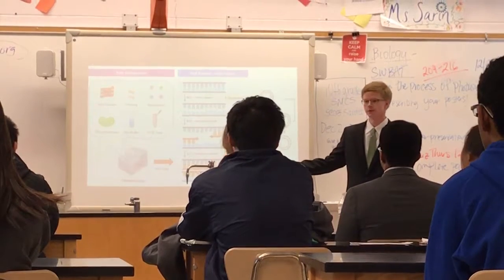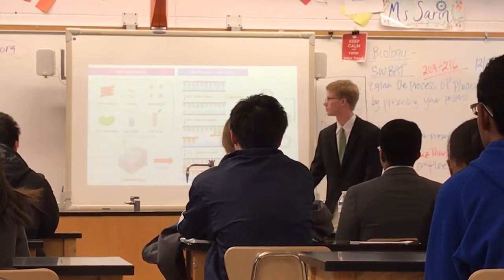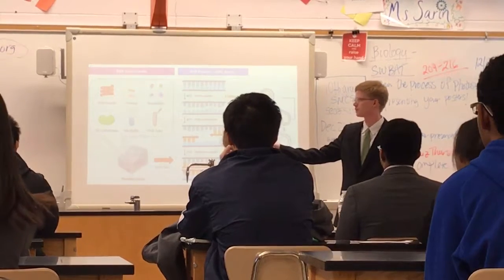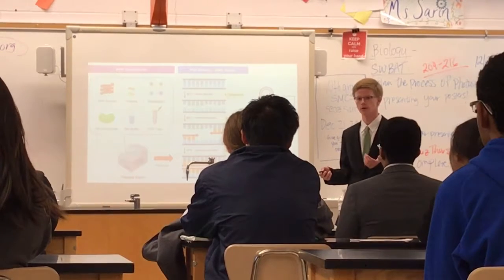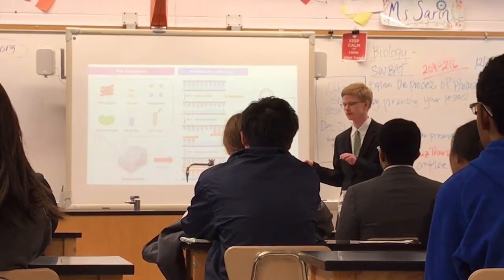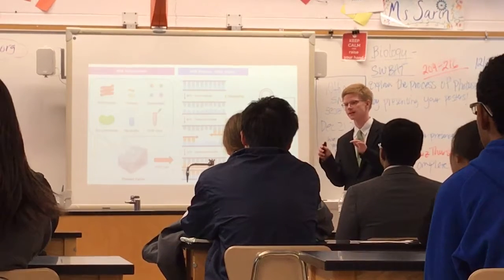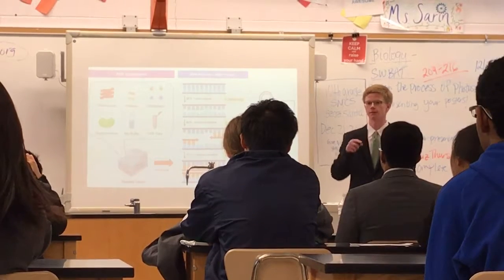So here's just an illustration of how this PCR works and how quick change PCR specifically works. So the PCR components you put in, you have this DNA sample, and these are plasmids I had that had this yeast RNase H2 protein coded in it. You put the primers in, but the primers are a little different. So with typical PCR, the primers match exactly to a piece of the template strand, so you get the template strand copy exactly.